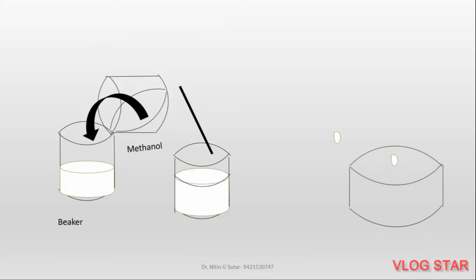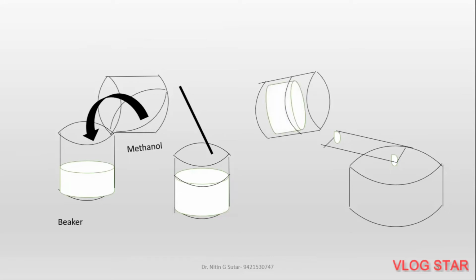Okay. After that, you have to take a large beaker. Then over that beaker, you have to hold your slide. The slide must be held in such a way that one end is towards you, in a somewhat above position, and the other end is in the beaker, in a somewhat downward, slanting position. So in this way, you have to hold that slide. Then you have to take the beaker of the suspension, then pour that mixture in this way.